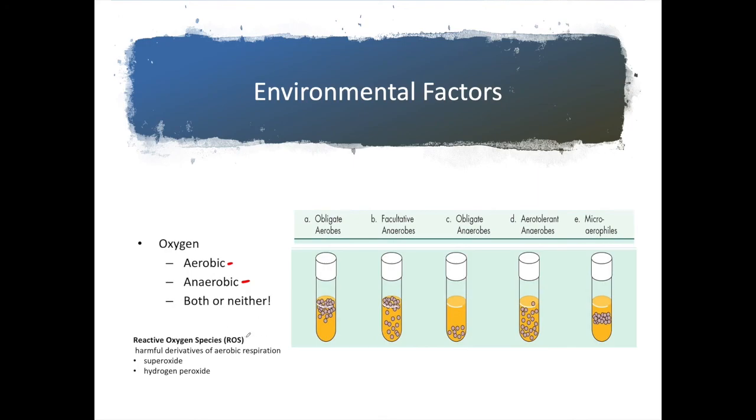For determining oxygen requirements, we use a test called an aerotolerance test. I'll just write it up here. In the aerotolerance test, we use a large test tube. So here I have a large test tube, and I fill it about three-quarters of the way with agar.